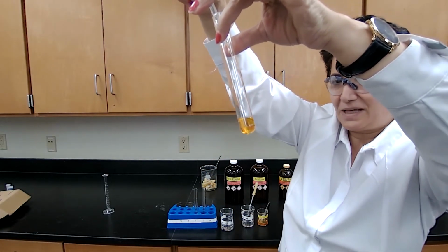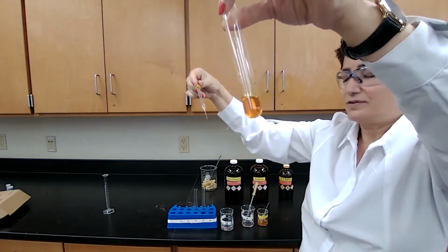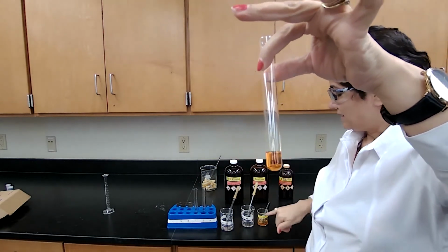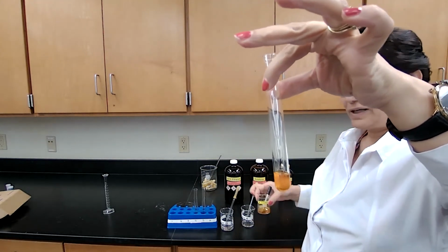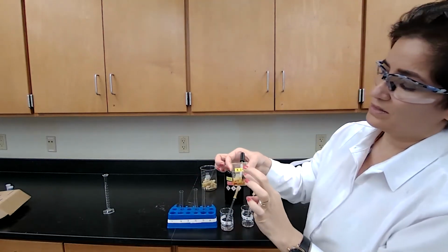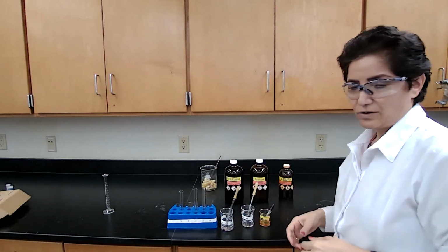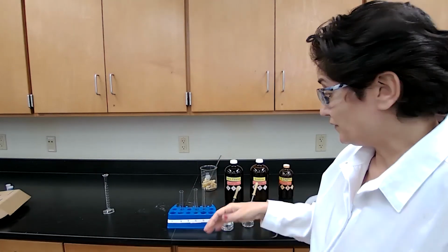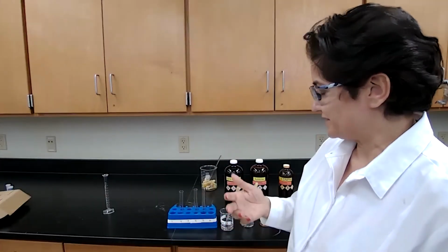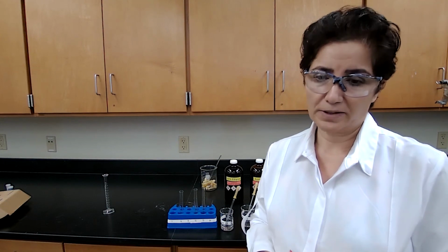There is no precipitate forming. And if no precipitate forms, that means it is a negative test for the 2,4-dinitrophenylhydrazine test, because the precipitate did not form. So we don't have a ketone. And thank you. That was a very short experiment for ketones and C=O double bonds in general.